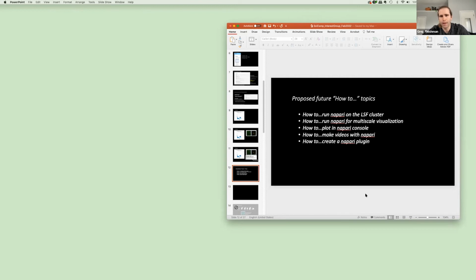But an extension could certainly be written to take an N5 input that has one scale level and create all the same scale levels that are in the stitched output. It's just that you have to pay for the resampling, right? Which makes sense if you want to visualize that result. But previously, the goal was just to put the data in the same place. And if you want to view it interactively, we probably should make those pyramids.